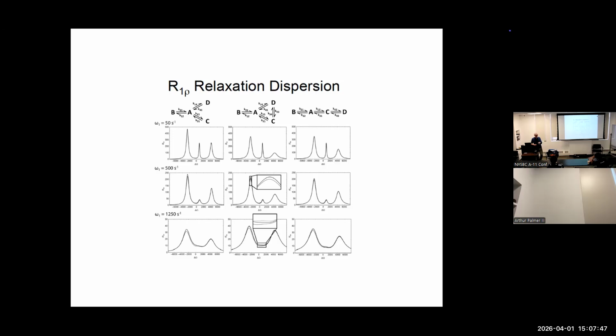So we can pretend the pulses are instantaneous. If that wasn't the case, then in principle, during the 180, we should be considering the R1 rho relaxation during the pulse, right? Because we've turned on the B1 field. And I think Christian Riesinger's lab has done some work there, but we haven't. And again, I think for studying dynamics, the R1 rho experiment just has a lot of advantages.